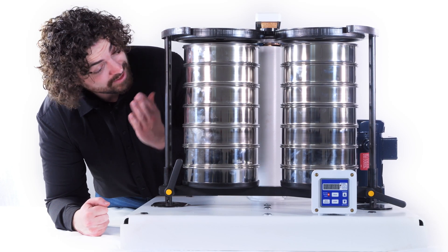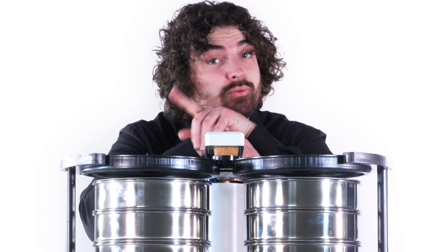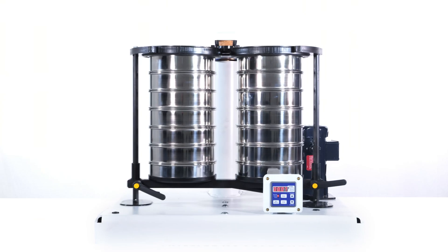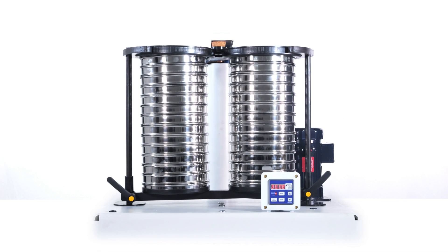And now we arrive at the RX94 — dare I say the coolest shaker of the series. It runs exactly like the RX29 except dual stacks — double the amount of particles to analyze, operation time sliced in half. This is the way. You can run 6 full height sieves with a full height pan and 13 half height sieves with a half height pan.